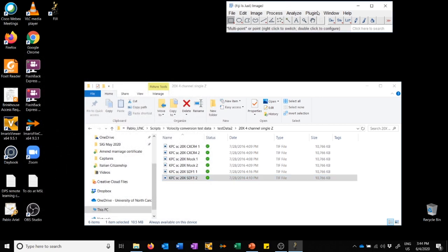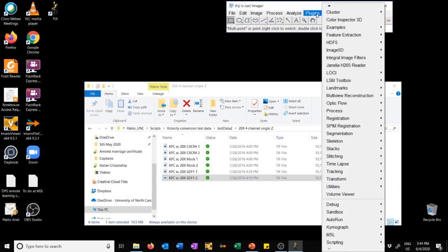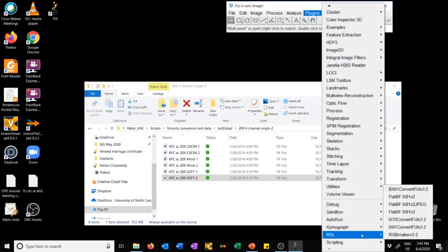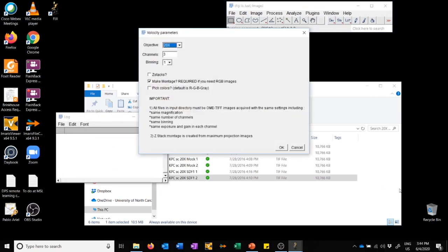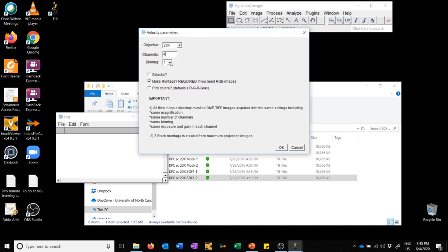So how do we use them? We go to Plugins, we go to MSL, and we run BX61 Convert Fiji. When we run this, we get the following dialog box where we need to choose the objective with which things were acquired. For this dataset, the objective used was the 20x. The number of channels of the dataset - for this particular case, there were four channels. The amount of binning - if you don't know, this number was almost certainly 1, that's the default on the Velocity software. We need to indicate whether we performed z-stacking, whether we took more than one image spaced in the z-dimension. In this case, we did not.